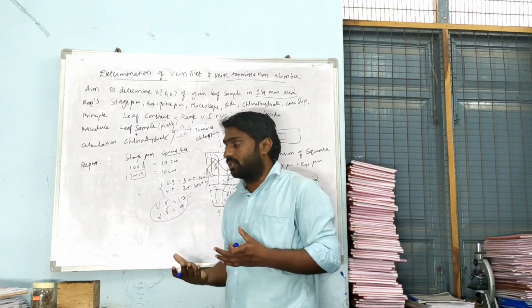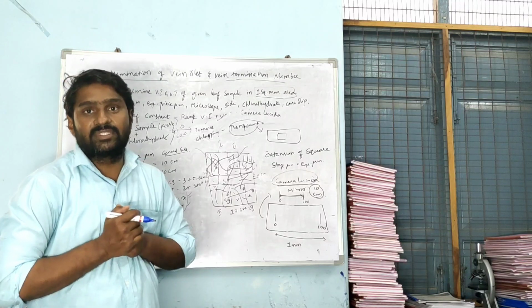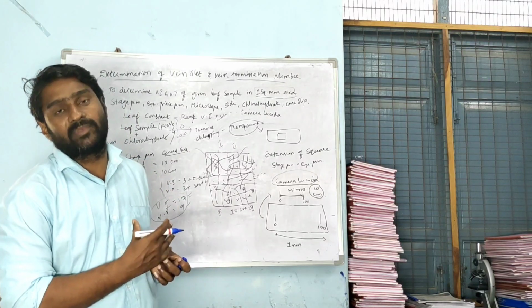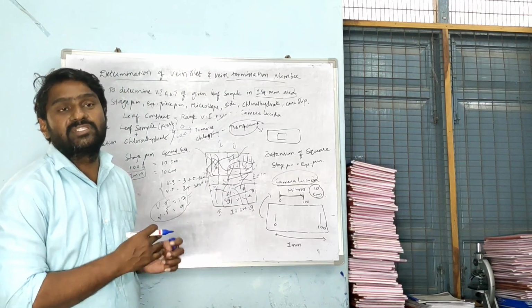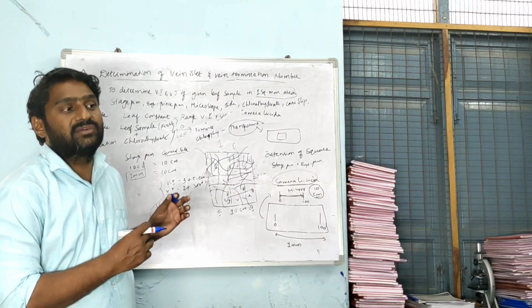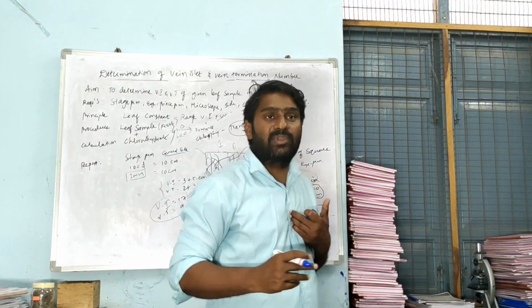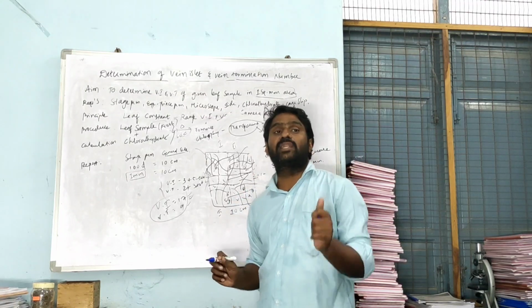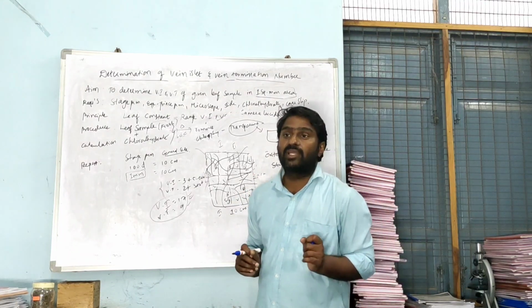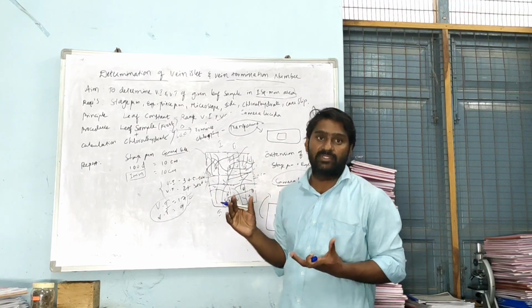In carrying out further tests and examinations for the leaf samples, this would be the basic microscopic analysis or microscopic evaluation parameter included under the detection of adulterants. As the leaf sample is detected for its number of vein islets and vein terminates, if this value is not matching with the standard leaf sample, then automatically you should come back and start your experiment again to find where the problem is.